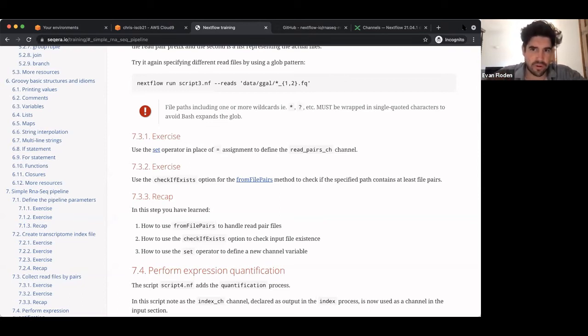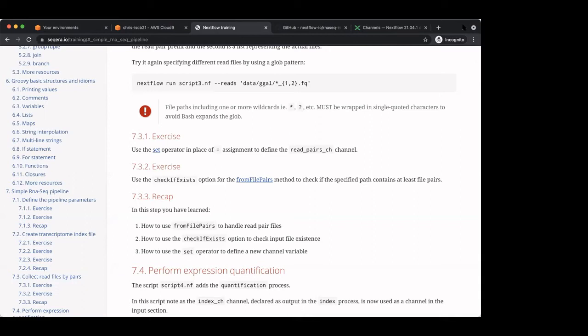Particularly there is a kind of heuristic here, meaning that we just observed that it is a common pattern to have an underscore to separate the sample ID from the suffix 1 and 2. So it was just stripped for these reasons. There is no other reason. These are just a common pattern that's being taken into consideration to remove the underscore. But the most important thing is that the star is the part that captures the expected sample ID, and then if there is an underscore, it is removed.